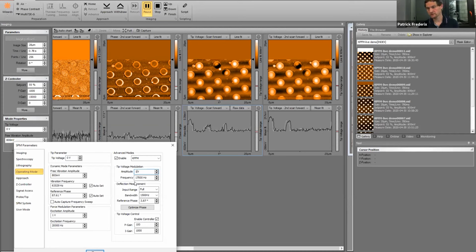Then you change to the sample that you want to measure and measure the contact potential of that sample and compare it with the one from the HOPG. But still, if the tip picks up some contamination from the surface, it will change the potential difference that you measure. So it's certainly not trivial to do it in ambient conditions.